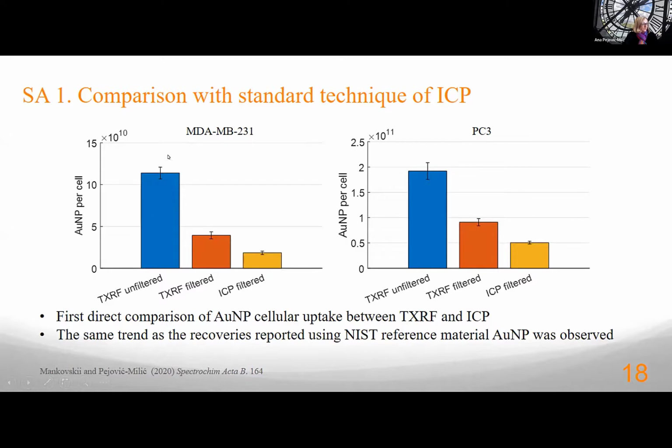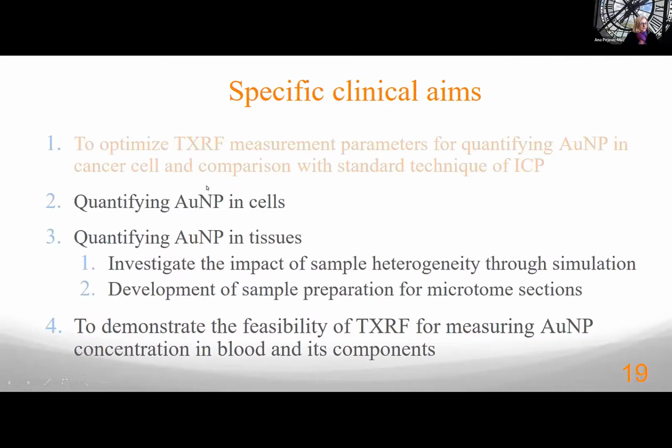But our aim was to basically show or test the ability of TXRF to reliably quantify gold nanoparticles in organic matrices, and in this case, it was in breast and prostate cancer cells. So this basically led us to conclude that we developed a proper TXRF-based method for gold nanoparticle quantification in cancer cells, and it opened a whole area of research to us. And Natasha will talk to you about quantifying gold nanoparticles in cell lines with a specific clinical question that we are focusing on at the moment.